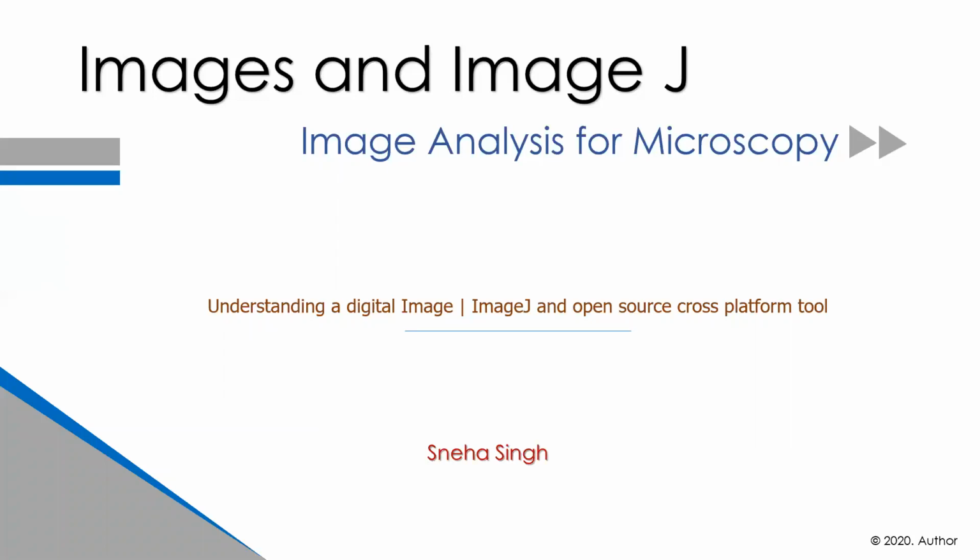Before we start learning, let me take you to a couple of introductory slides on digital images and why we need image analysis. So what is a digital image? An image that is taken through a digital device like a cell phone, camera or any digital means. Okay, so now what you see in this image, an eye.